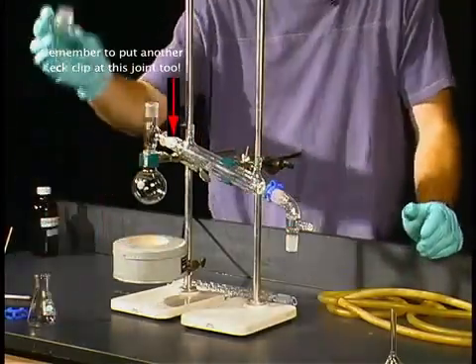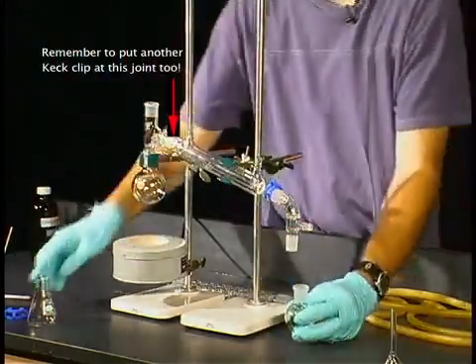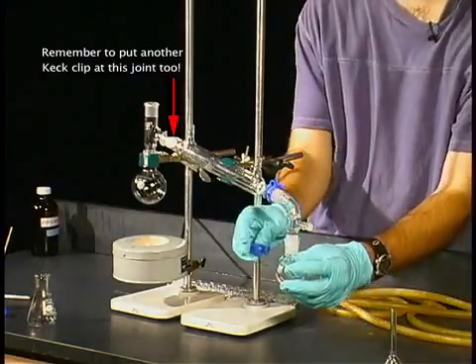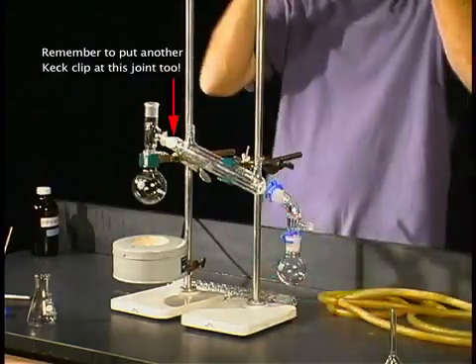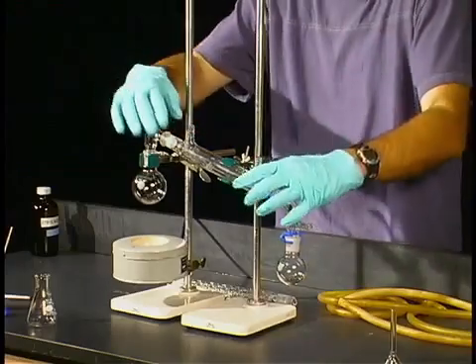I'm going to use a round bottom flask as our receiving flask. We just add it in there and we can add a keck clip to secure it.